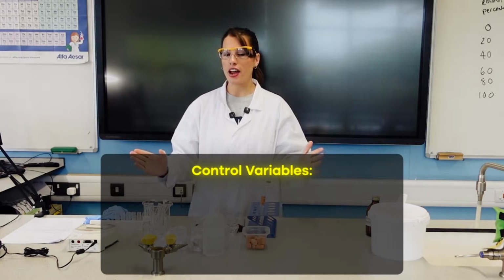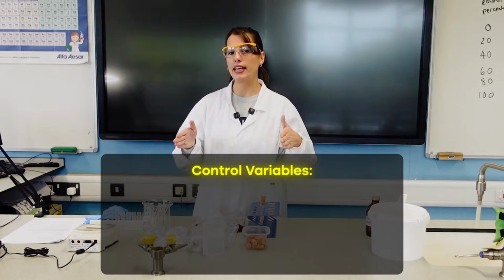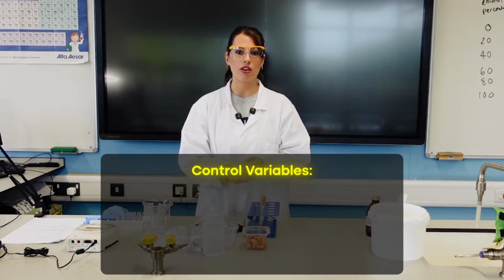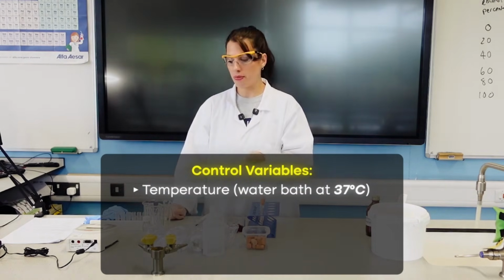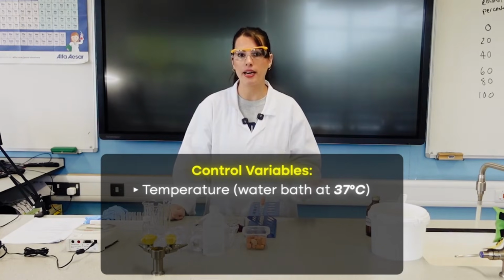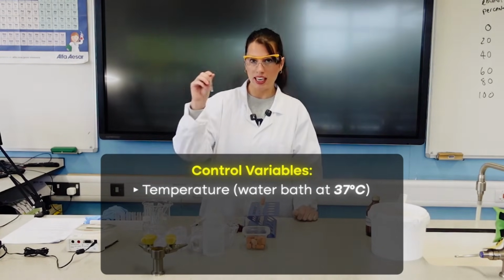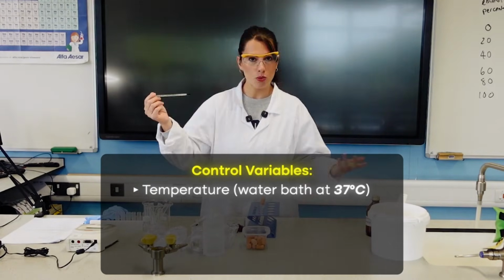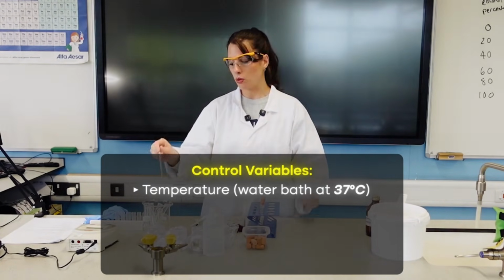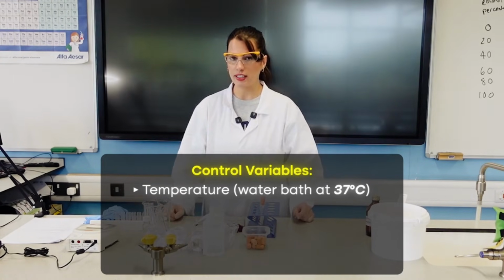And then control variables. Some of them I've mentioned as I was going through the equipment, but let's just have a solid list so you know what to make the students aware of. Temperature of the water bath, because temperature is going to affect diffusion and also it can affect the permeability of the membrane. And I'm going to be controlling that by using a water bath. Make sure the students are keeping an eye on the temperature throughout, because the temperature will decrease. They might need to add more hot water to make sure it stays at whatever temperature you go for. I'm going to go for 37 degrees C.